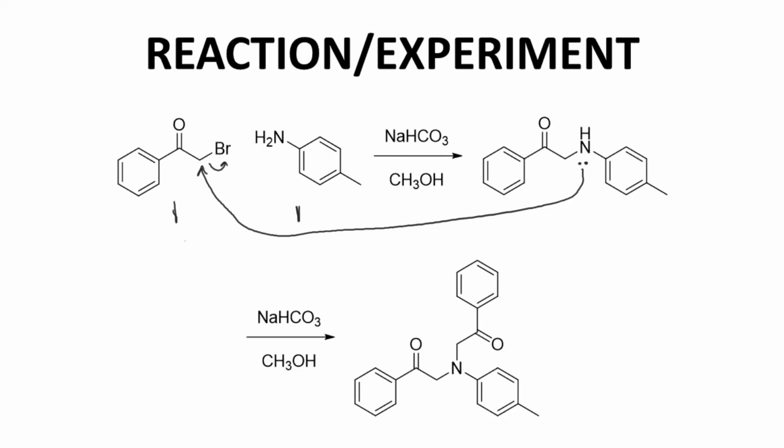I knew that this double SN2 product was a possibility, but very early in the experiment, I convinced myself that the impurity was the aniline starting material. Now that I've looked more closely at the data, the double alkylation product seems much more likely. Let's go back to the NMR data.